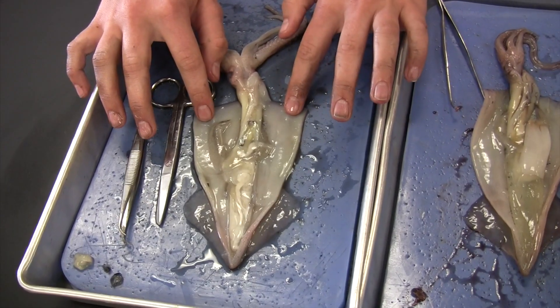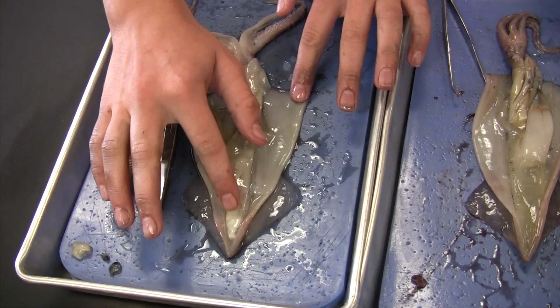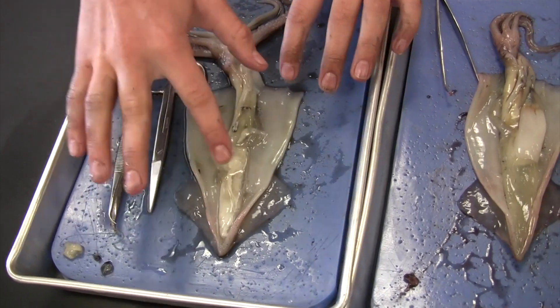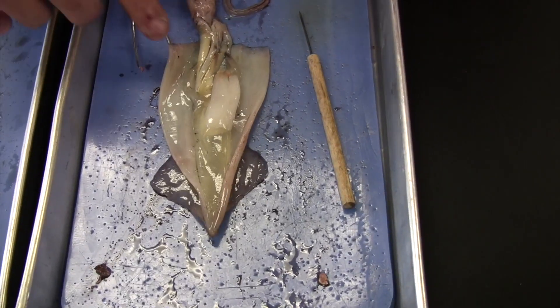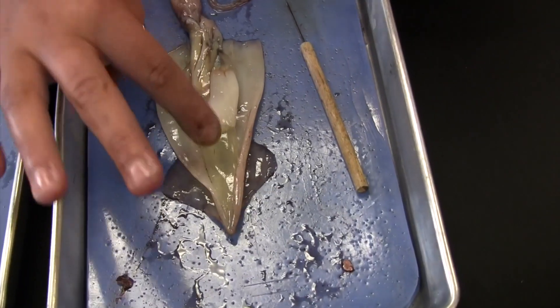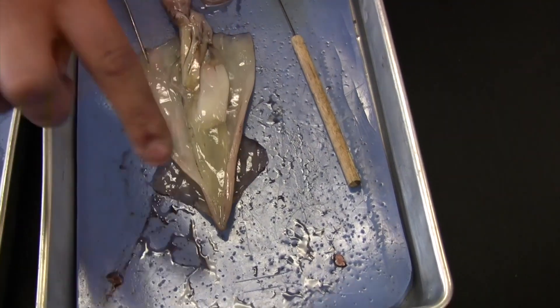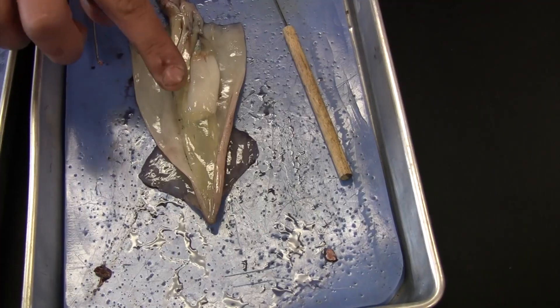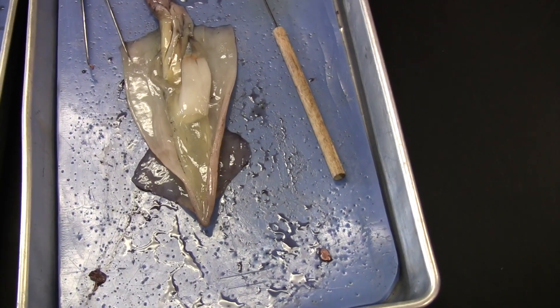You can tell that this is a boy squid because this is the gonad, and it's a milky white color. You can tell this is a female because these are the eggs. The eggs are a jelly-like substance. And then this is the nidamental gland, which is different from the males because the males don't have that gland.